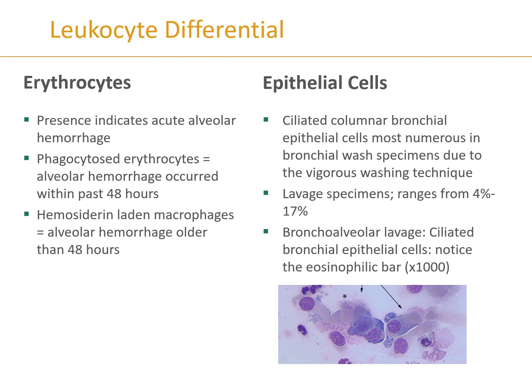And so these cells, you're going to see them within that cytospin slide when you make it, so you can see that they're a little bit of a different shape. They're kind of pinched off a little bit.